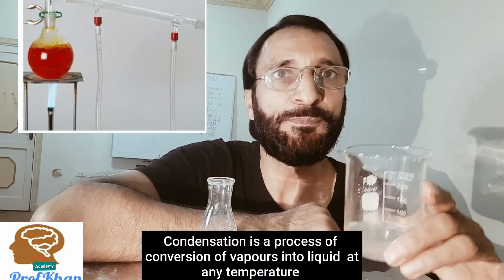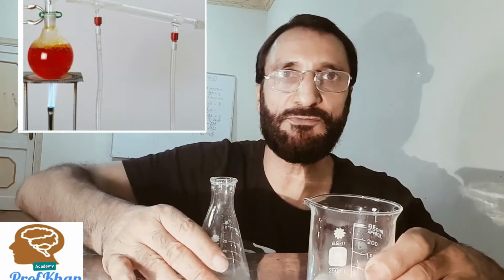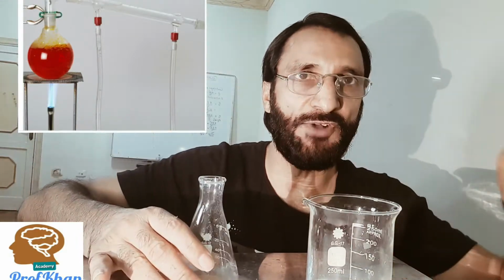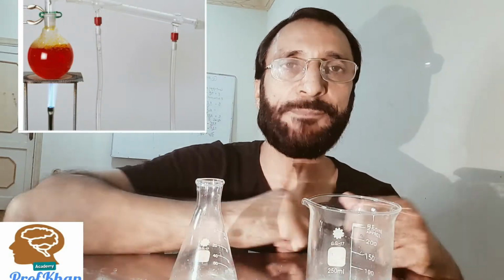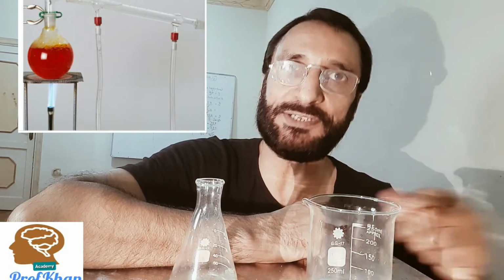Now for this we need some apparatus. Number one, we need the beaker, then we have the flask and the funnel, and then there is a delivery tube also. Now let's start to do the practical. Let us start a procedure to separate water from the solution of the salt. First of all, I would like to show you the setup which I had made to separate water from the solution of salt.